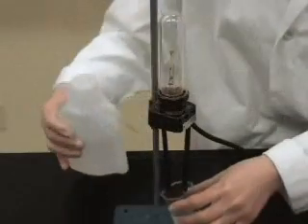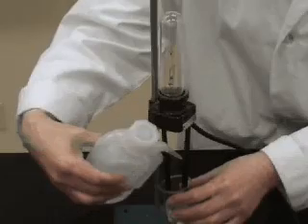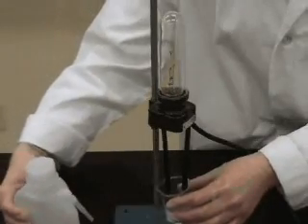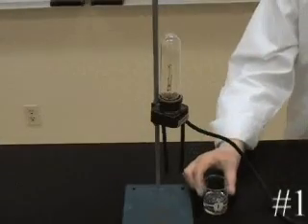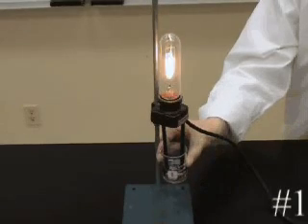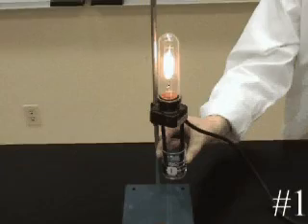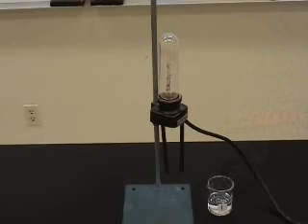Rinse the terminals of the conductivity tester. This will remove any traces of previously tested solutions. To test the conductivity of a solution, place the terminals of the conductivity tester into the solution. Record your observations here. This completes the test on solution number 1.